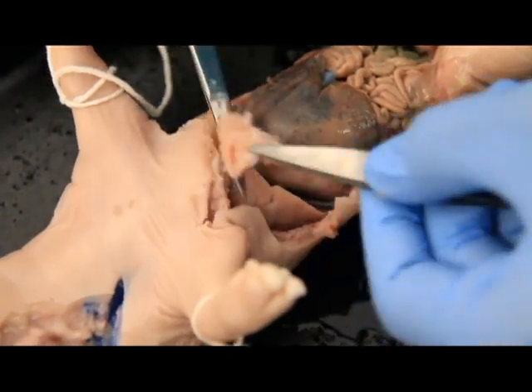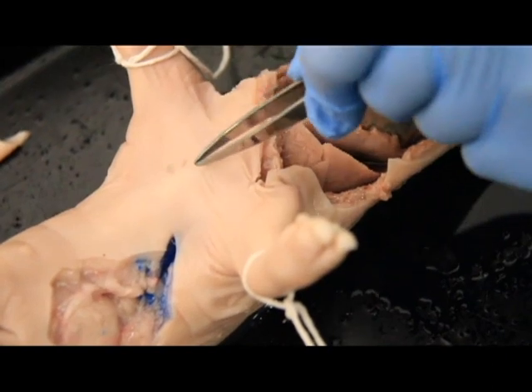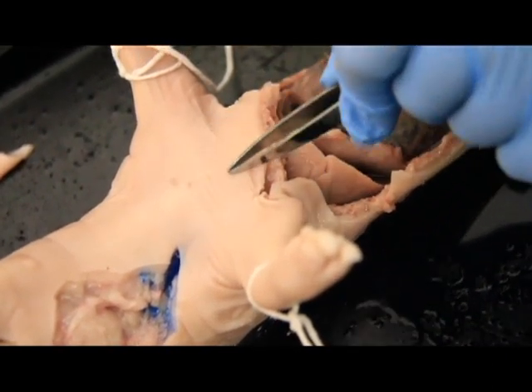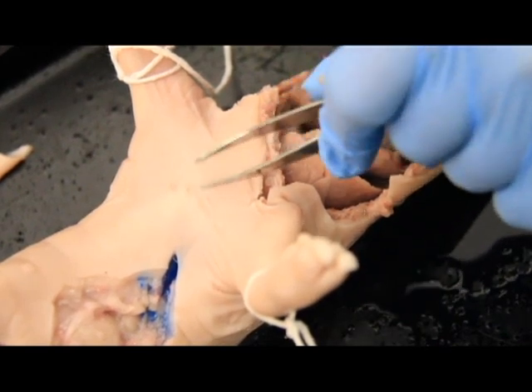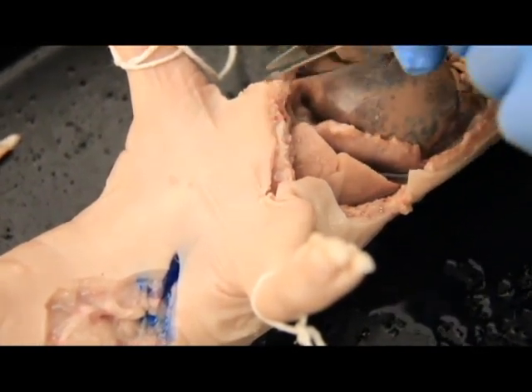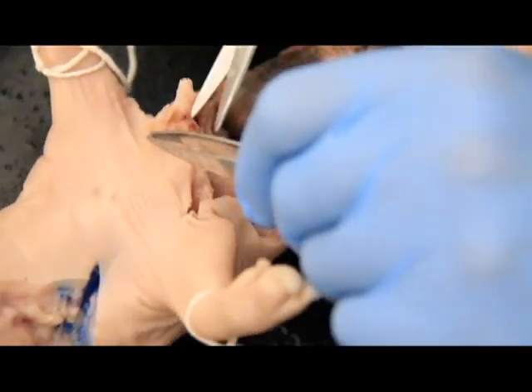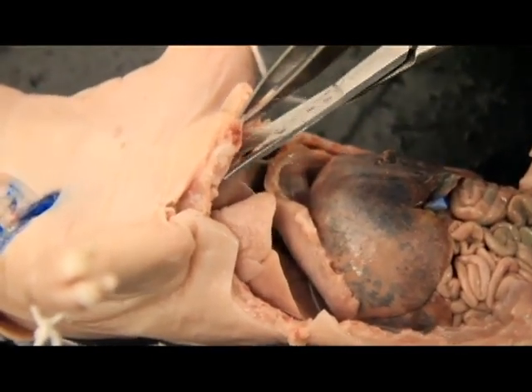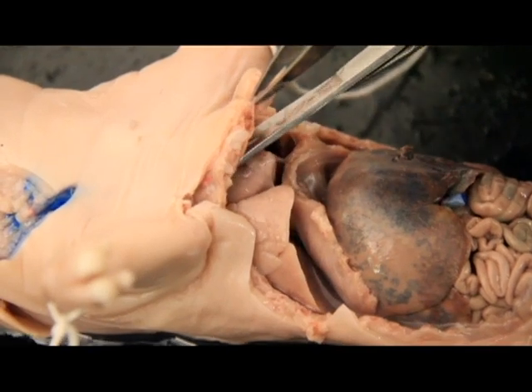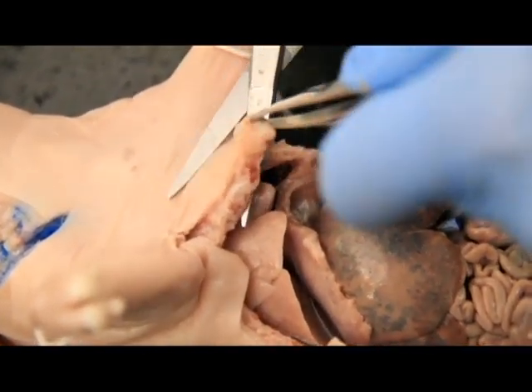What's really important is once you get here, this is the breastbone right in between the arms. This has a lot of circulatory system right here. So a lot of very thin veins and arteries. So we want to avoid this area until week 2. But for right now, we want to cut as much of this open as possible. So now I'm going to cut just above the rib cage. You can see here, just below the rib cage, kind of separating this membrane from the ribs. And then I'm lifting and cutting away.